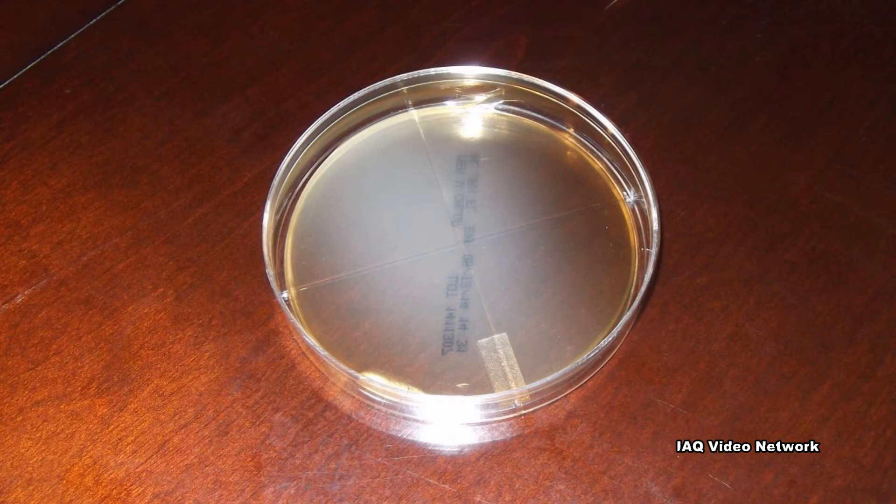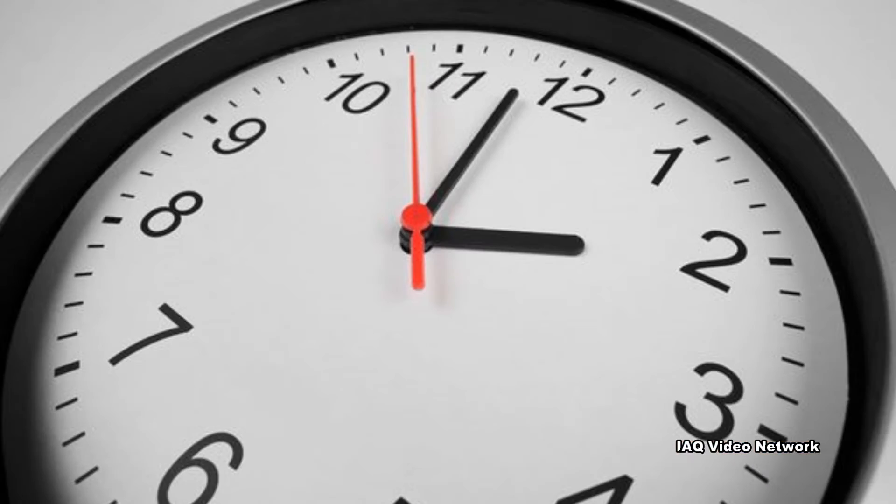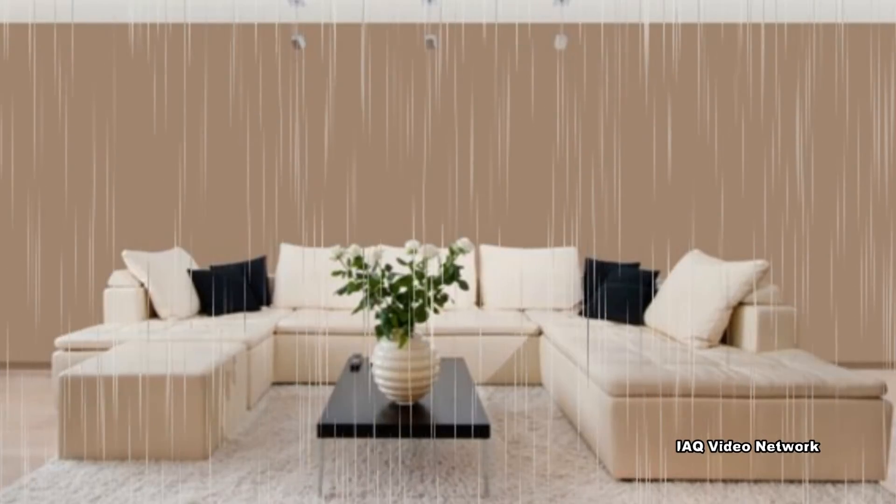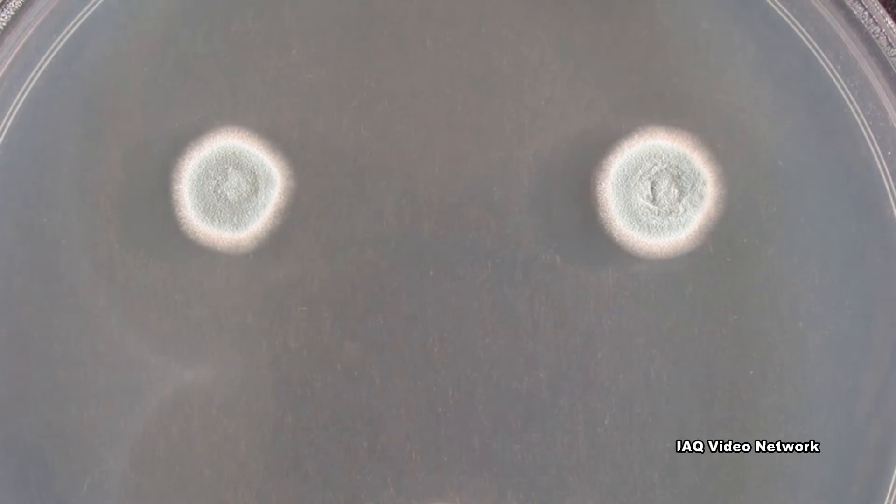Settling plates are petri dishes set out over a period of time to determine the presence of mold. The concept is that mold in the air will settle on the plates and begin to grow as the mold uses the agar in the petri dish as a food source.